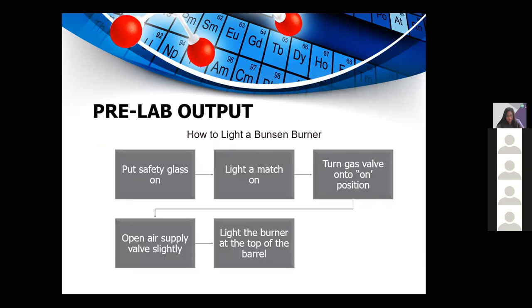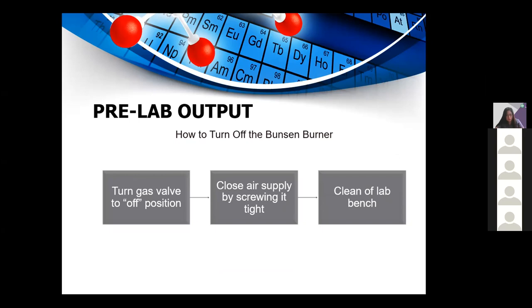How to light a Bunsen burner: first, put your safety glasses on to protect your eyes from any potential harm. Then light a match, turn the gas valve to the on position, open the air supply valve slightly, and light the burner at the top of the barrel. To turn off: turn the gas valve to off position, close the air supply by screwing it in, then clean off the lab bench.